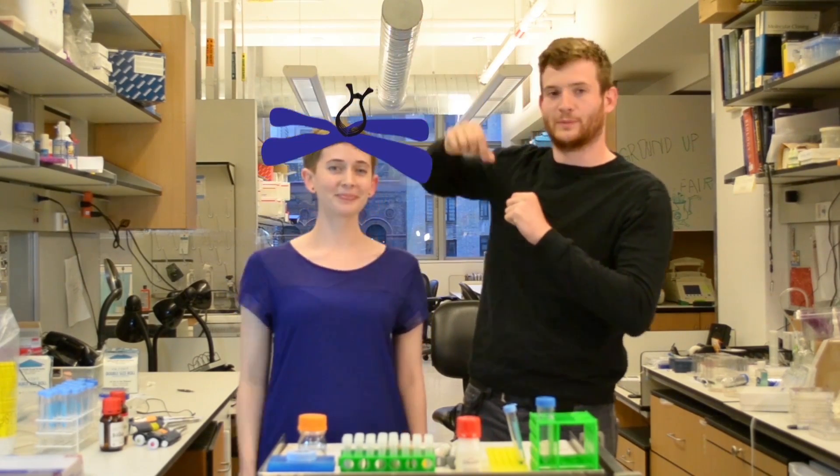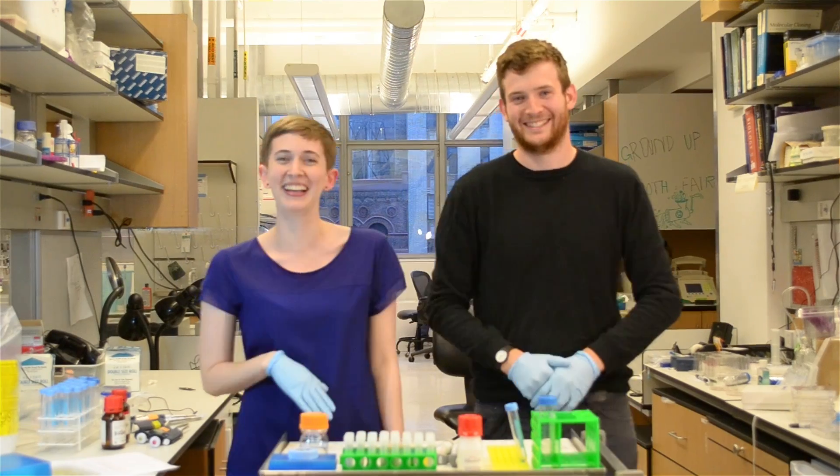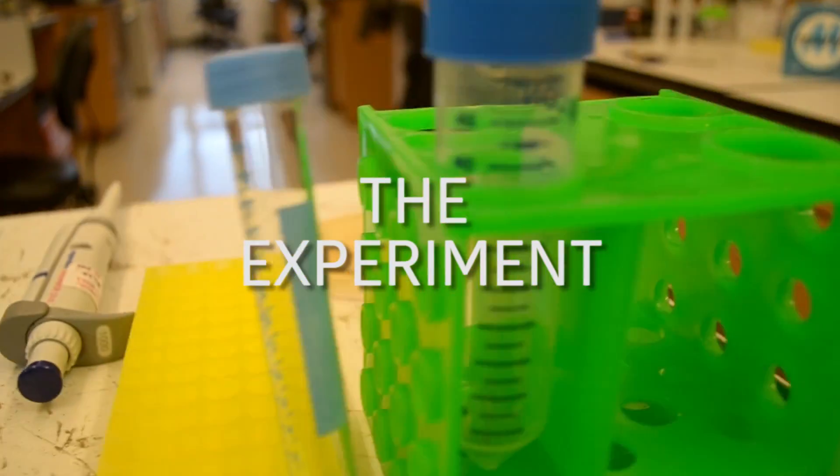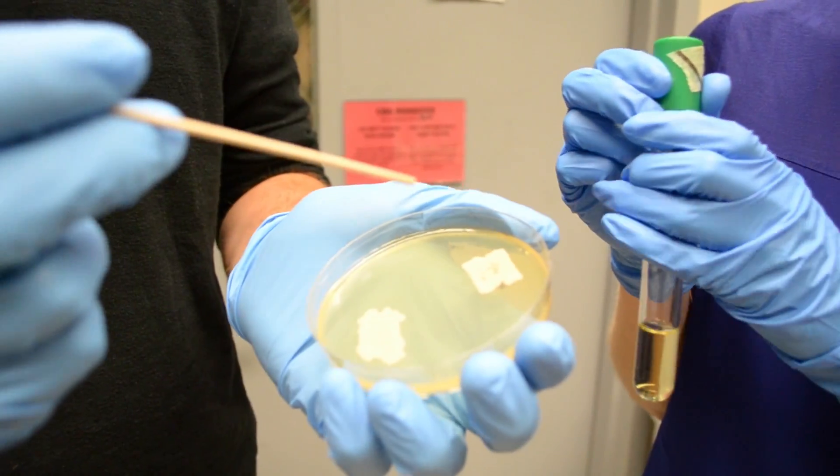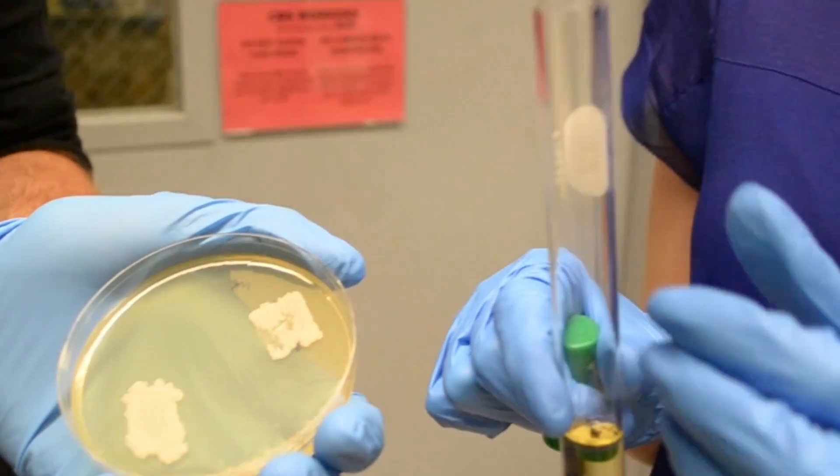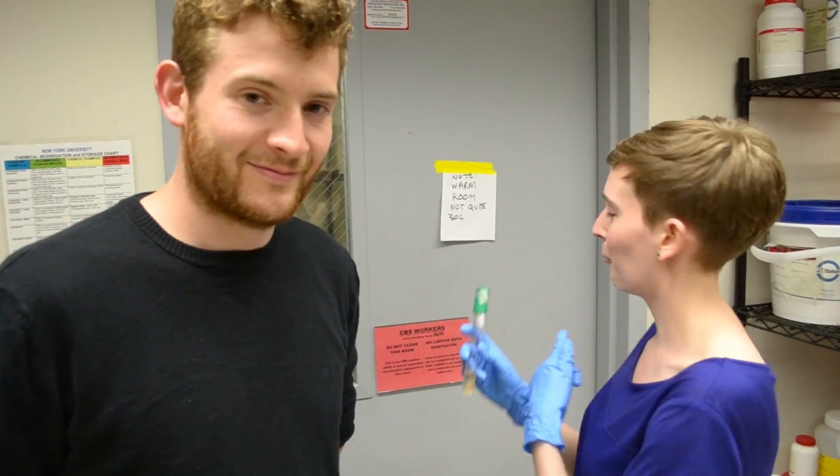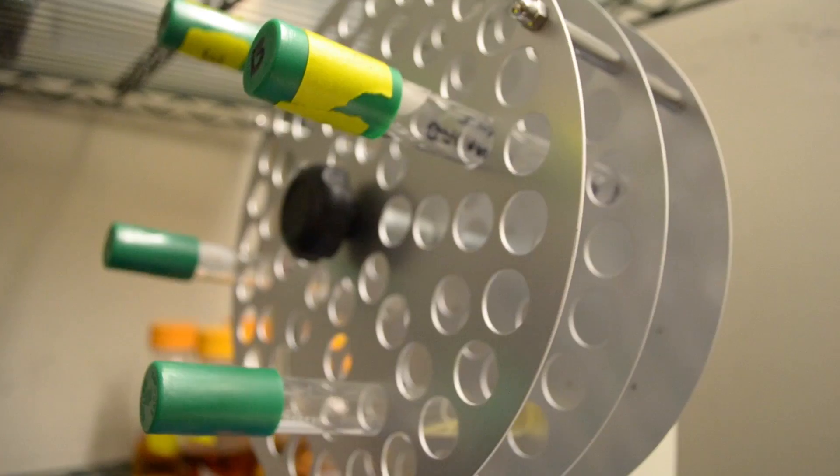We're going to start off by taking some of the yeast that's been growing on this plate. I'm going to scrape a little bit off and put it into some nice liquid food for it to grow in. Now we're going into this warm room so that the yeast can be happy and warm while it's growing.